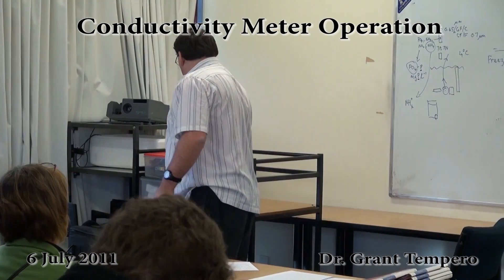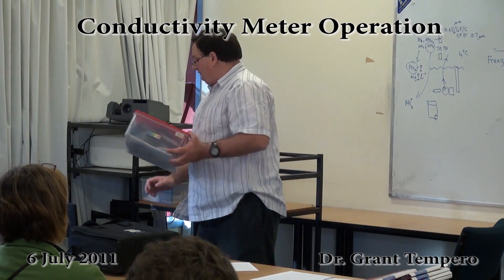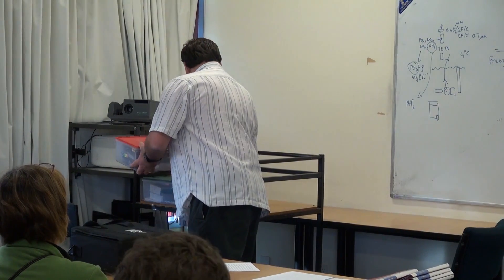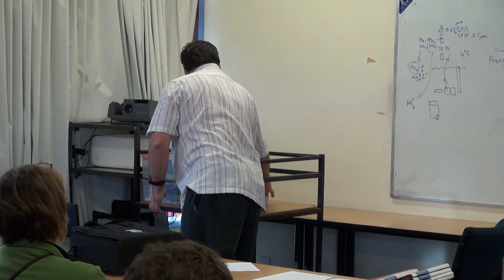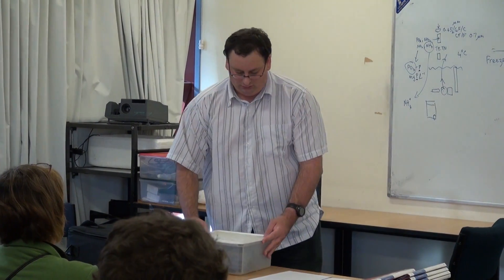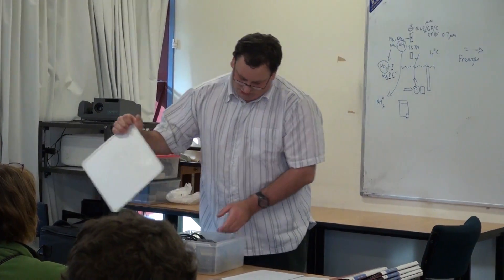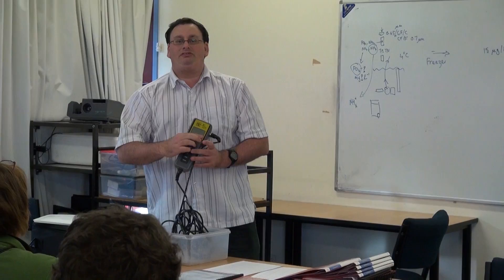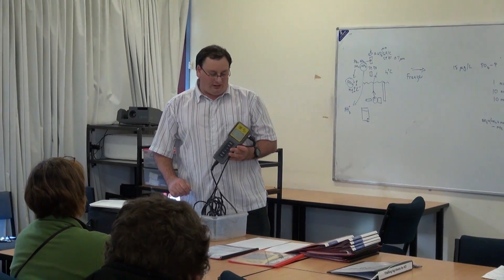Okay, the next one is the conductivity meter. This is the typical conductivity meter we're using. This is the YSI 30.